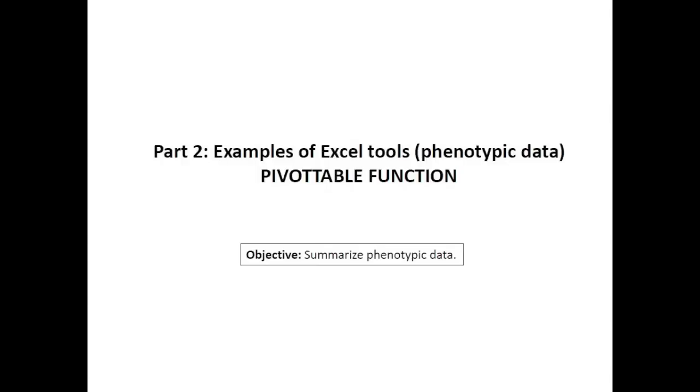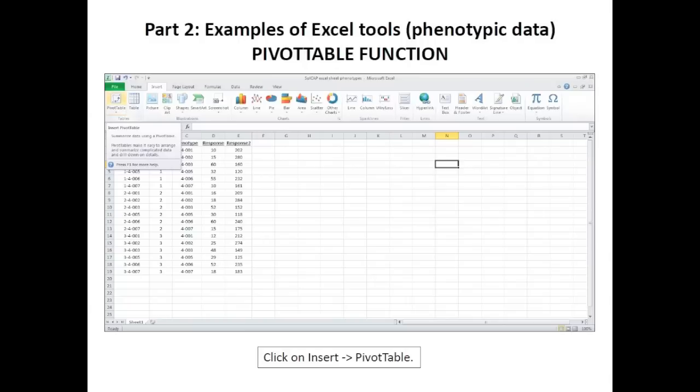Another trick I wanted to show you guys with your phenotypic data is a pivot table function. And the objective of this is to summarize phenotypic data. Of course, this is just one of many ways to do this, but it's one way I like to summarize.